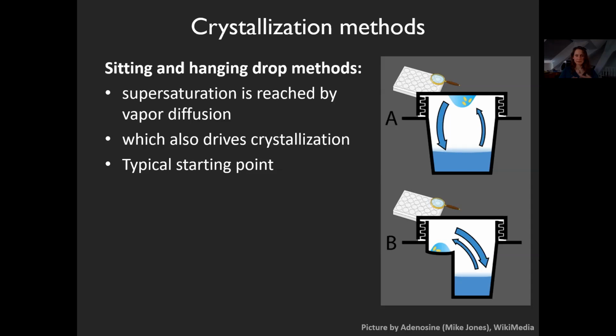Not only does the protein concentration in the drop increase, also the precipitants. Has anyone an idea to what that could lead? That can lead to a very common problem. You get not protein crystals. Your protein decides to precipitate or not do anything, but you get salt crystals. And you're very happy because after 2 days you have these beautiful, nicely shaped, blocky crystals.